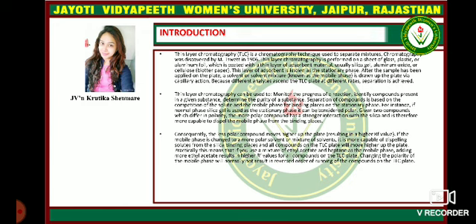Separation of the compounds is based on the competition of the solute and the mobile phase for binding places on the stationary phase. For instance, if normal phase silica gel is used as the stationary phase, it can be considered polar. Given two compounds which differ in polarity, the more polar compound has a stronger interaction with the silica and is therefore more capable of dispelling the mobile phase from the binding places. Consequently, the less polar compound moves higher up the plate, resulting in a higher retention factor (Rf) value.